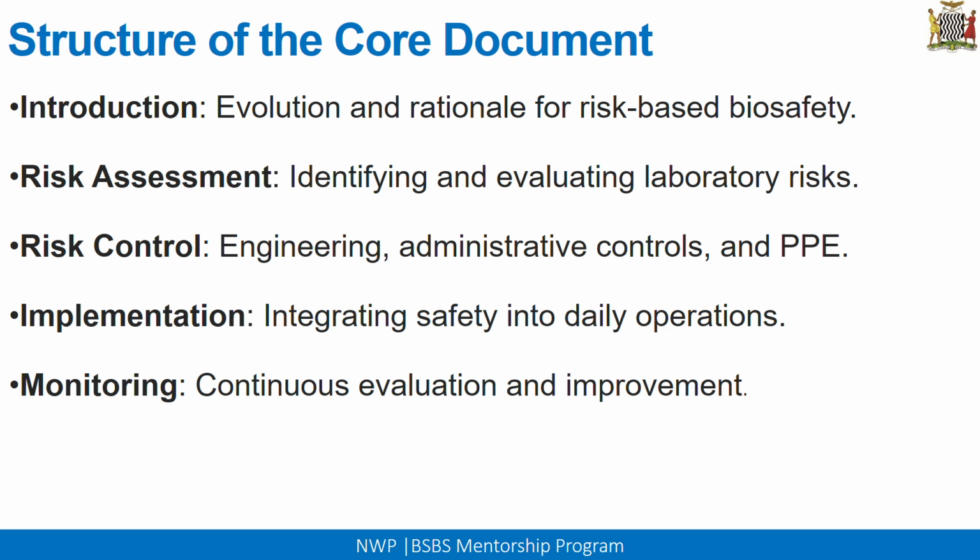Then after you do your risk assessment, there's risk control. So there are a lot of different types of risk control measures. So we have your engineering controls, you may have your administrative controls, PPE as well as other types of control measures.